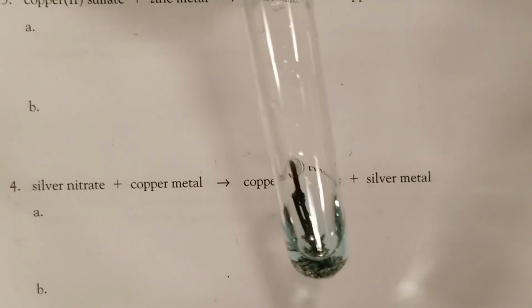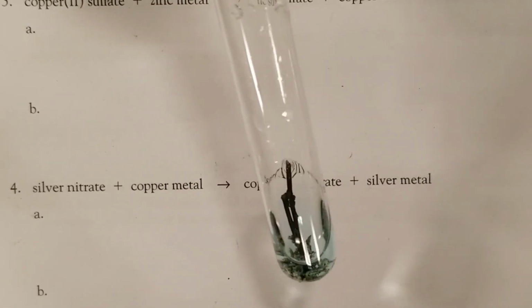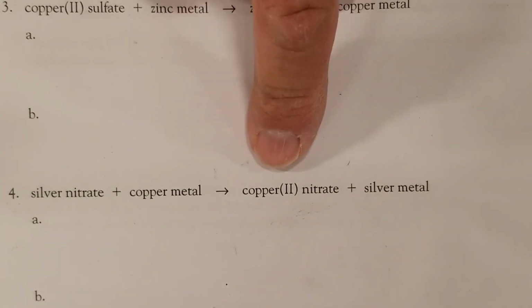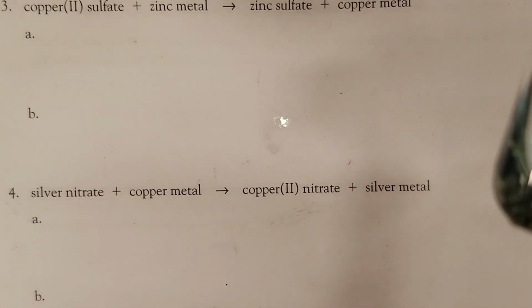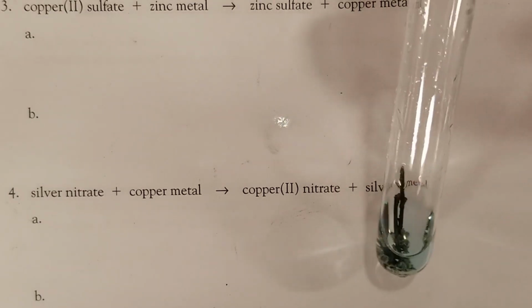So, about 10 minutes later, you can see how the solution's taking on that blue color. That blue color is due to the formation of the copper(II) nitrate, which is aqueous and dissolves in solution. And hopefully you can see some kind of granular silver at the base of the test tube.